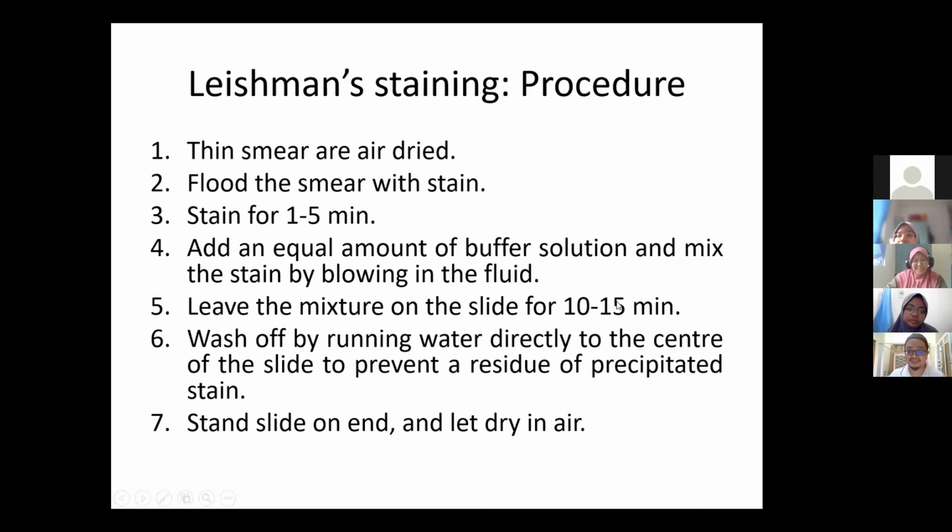Leave the mixture on the slide for 10 to 15 minutes and then wash off with running water. Again, wash with running water in a gentle manner. Firstly, the amount of running pipe water should not be very big, but should also not be too small. If it is too small, sometimes it can tear the smear. So just nice.